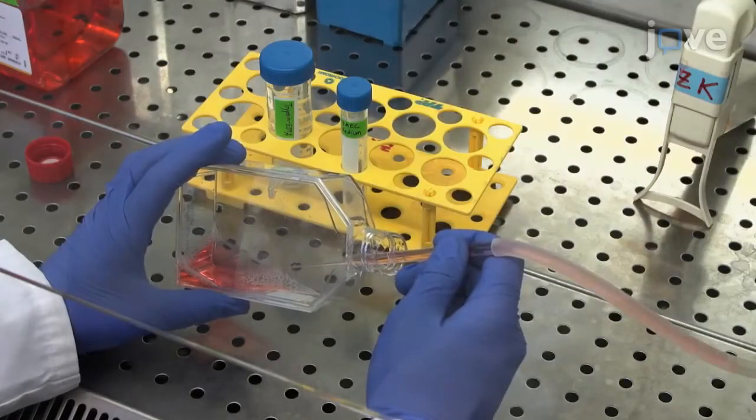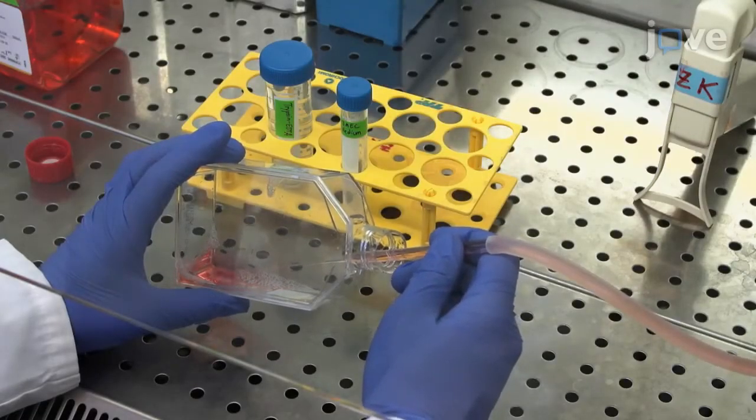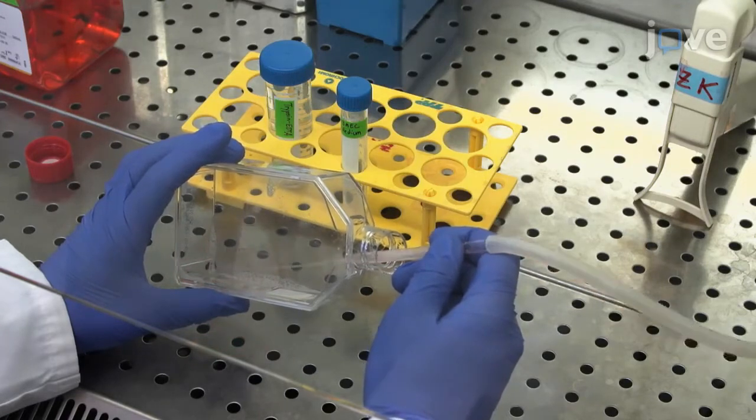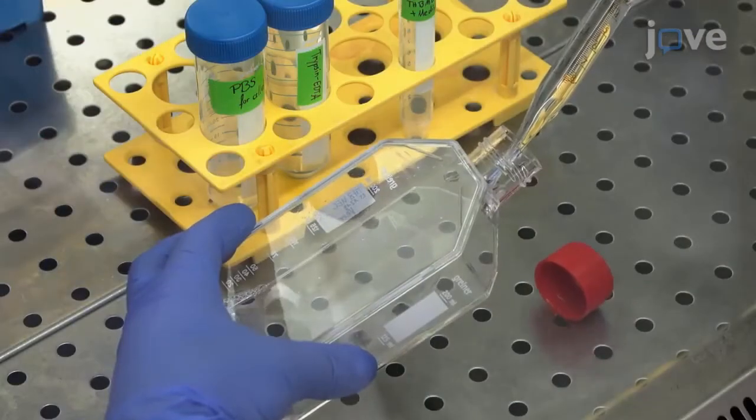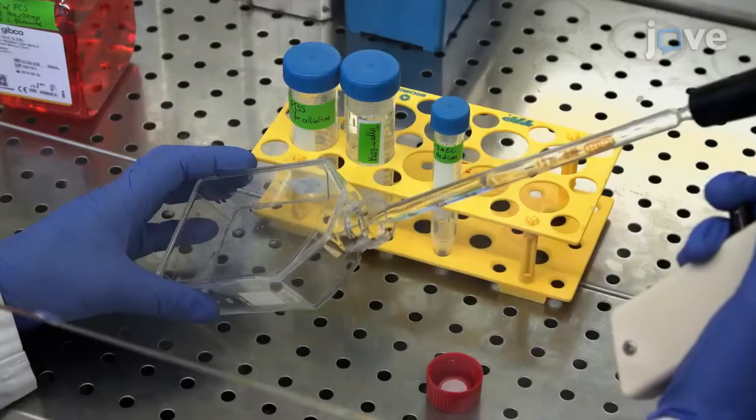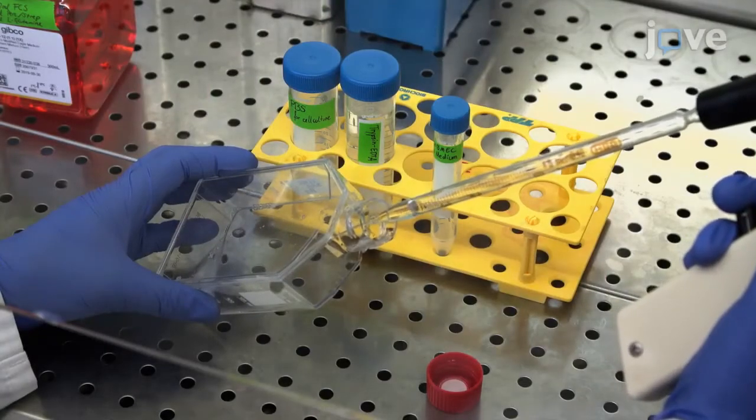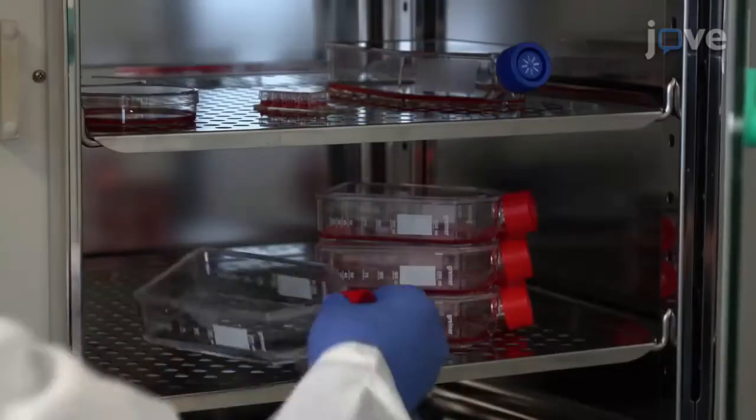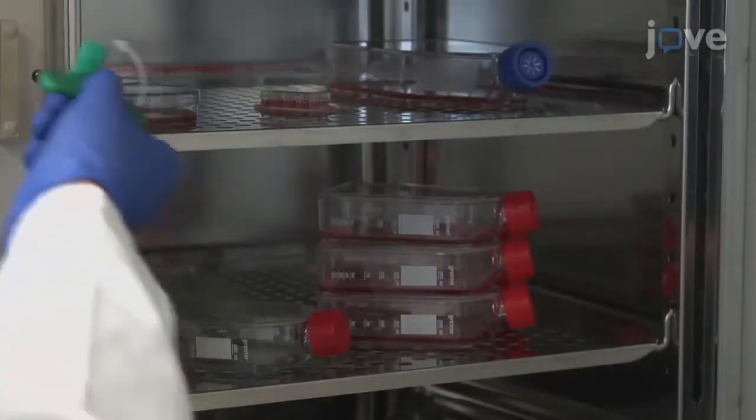To seed the human microvascular endothelial cells, aspirate the medium from the cell culture flask and wash the cells with 10 milliliters of PBS. Cover the cells completely with 5 milliliters of trypsin EDTA and incubate the flask for 3 to 5 minutes at 37 degrees Celsius.